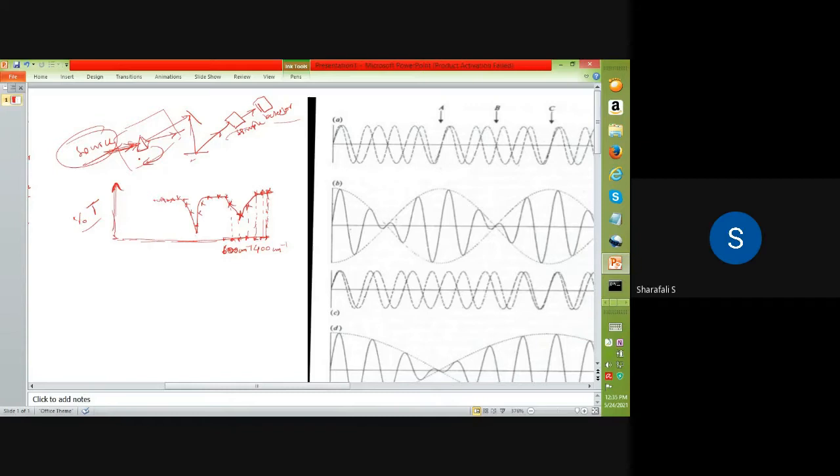But we have to consider each and every frequency in this case. Even though it is done mechanically by the spectrometer, it will take some few minutes, for example, 15 minutes, 20 minutes. So in normal IR spectrometer, it will take some time to get the spectra for the sample.